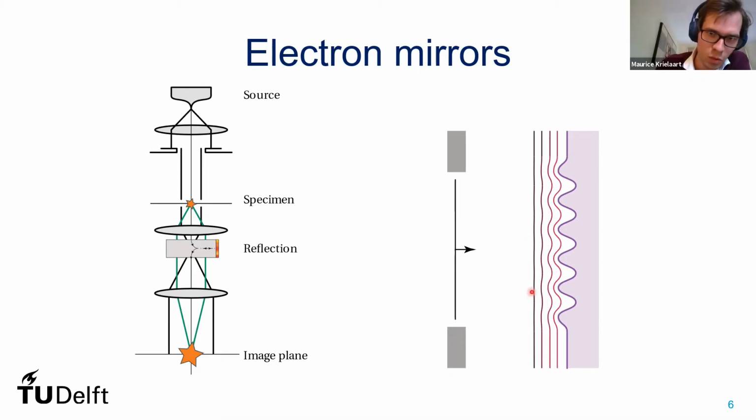But now if you carefully look at this pattern, I click to the next slide, you see there's no reason not to replace this topographic pattern with a pixel-wise pattern, which technologically might be difficult to fabricate, but hey, we have the entire backplane of this electrode available for all of our logic wires, so why not give that a try? We're not there yet, but that's definitely where we want to go.